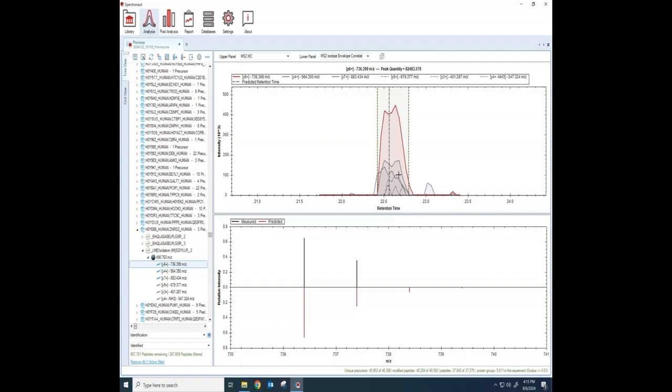You can see that even in some of these fragments, there's different colors, because it actually used for quantitation those three fragments. Those are the best three fragments that it used, the area underneath the curve here for quantitation. So you can see this big red guy here. Sometimes people have mentioned the number of points across the peak. And this is where this is the most important. For quantitation, we are measuring quantitation by finding the area underneath this peak.